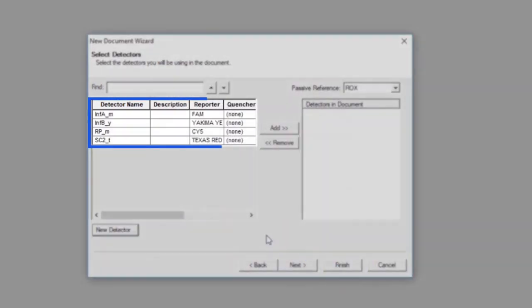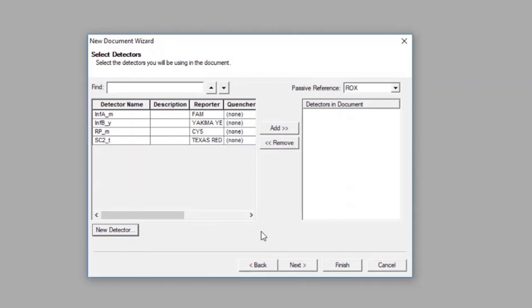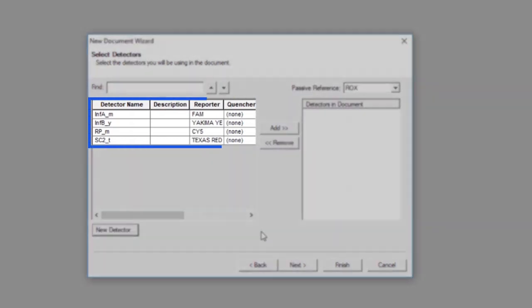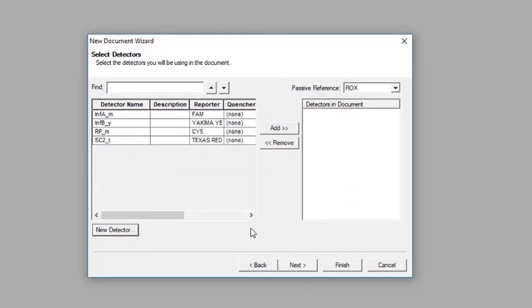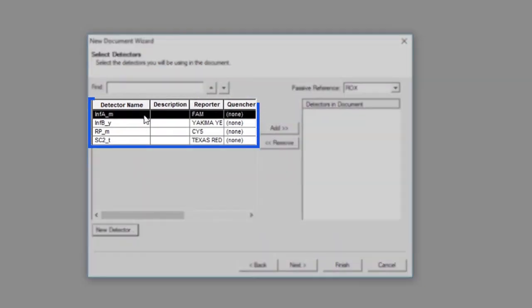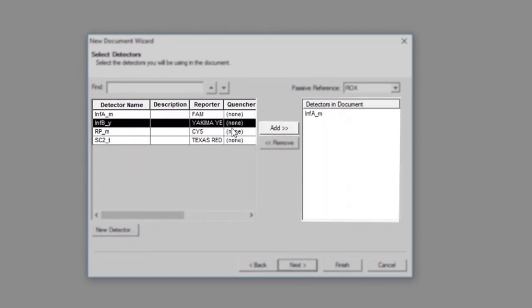Now that all four detectors of the FLU SC2 Multiplex Assay have been created, these new detectors will be added into the Select Detectors screen. Before proceeding, the four FLU SC2 Multiplex Assay detectors must be added to the document. To add the new detectors, select each of the four detectors from the list on the left side of the screen and click Add.